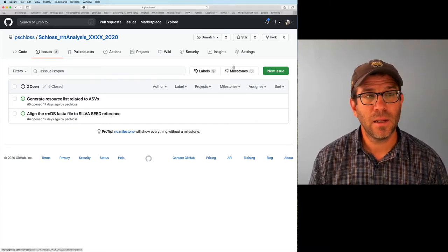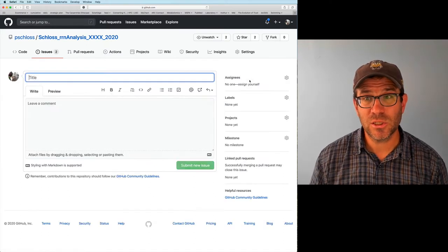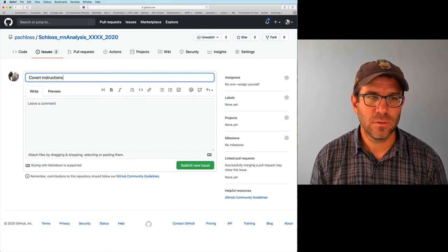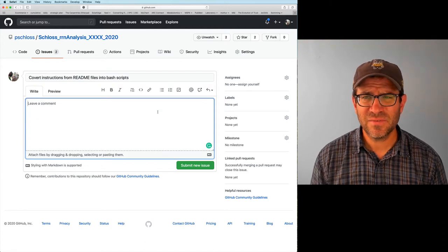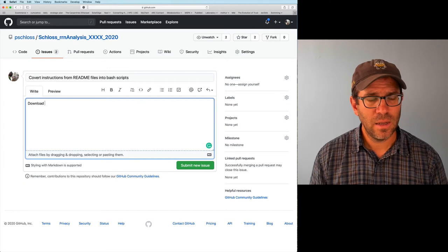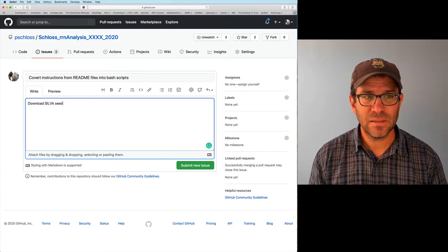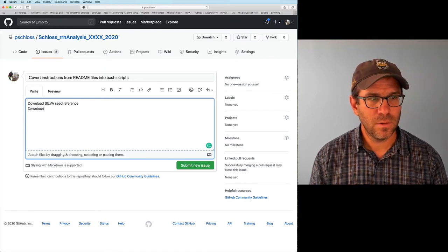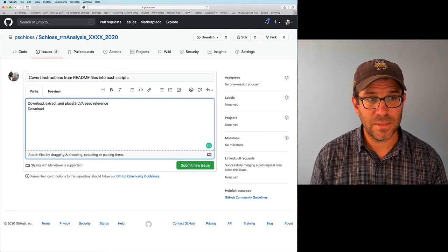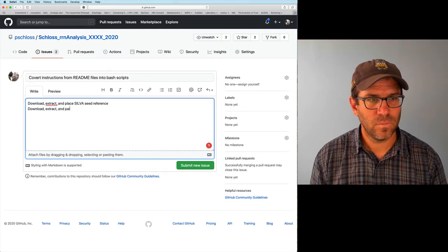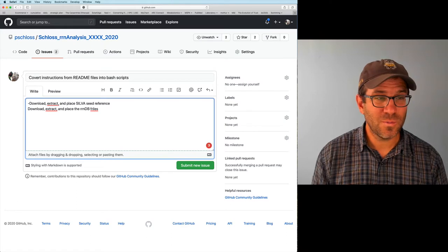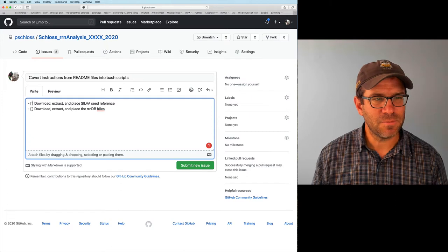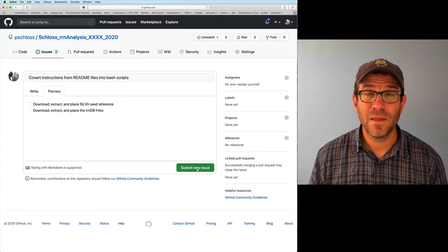I'm over here in GitHub in my project repository. I'm going to go ahead and create a new issue: convert instructions from readme files into bash scripts. We need to download the Silva seed reference and download, extract, and place the RRNDB files. I'll use markdown checkboxes. That looks good — submit that issue. This is issue 8.